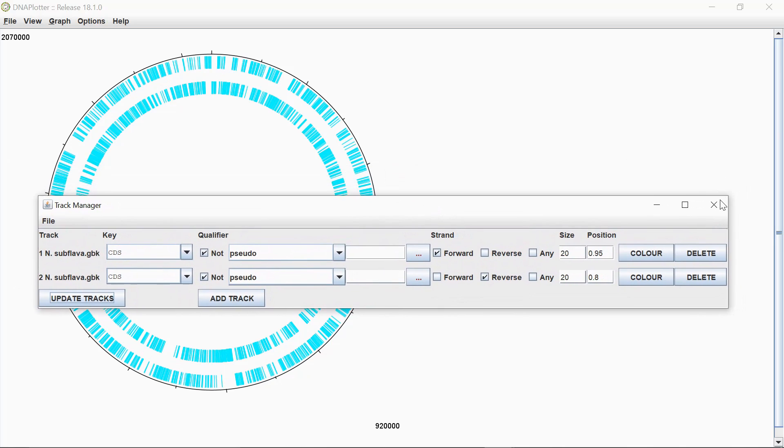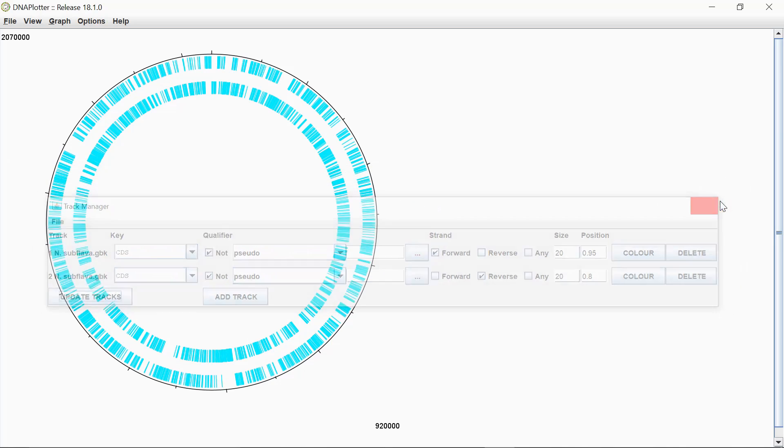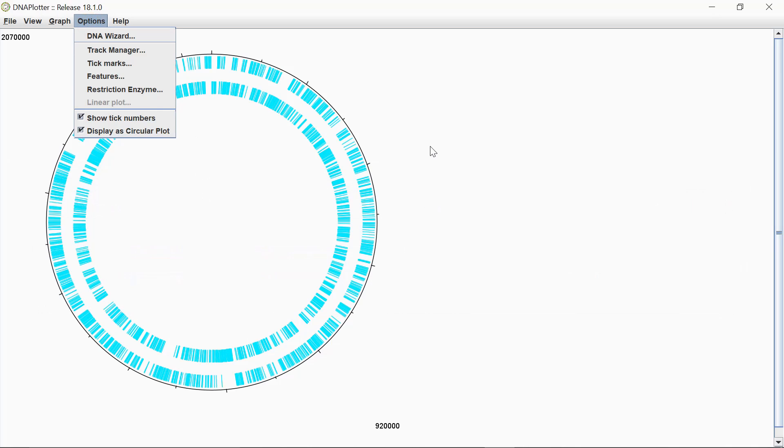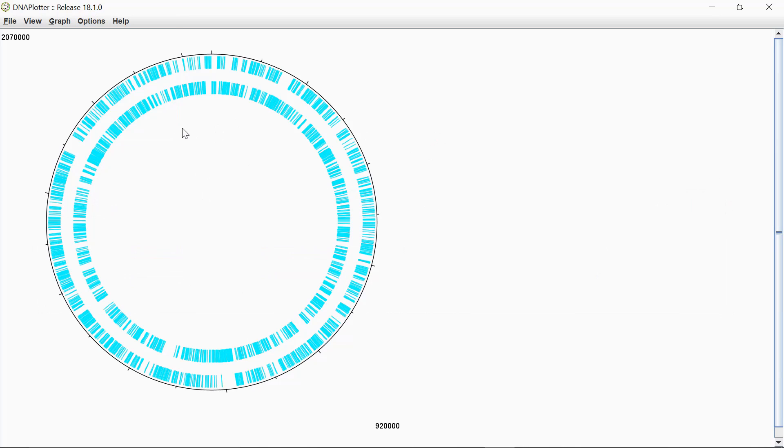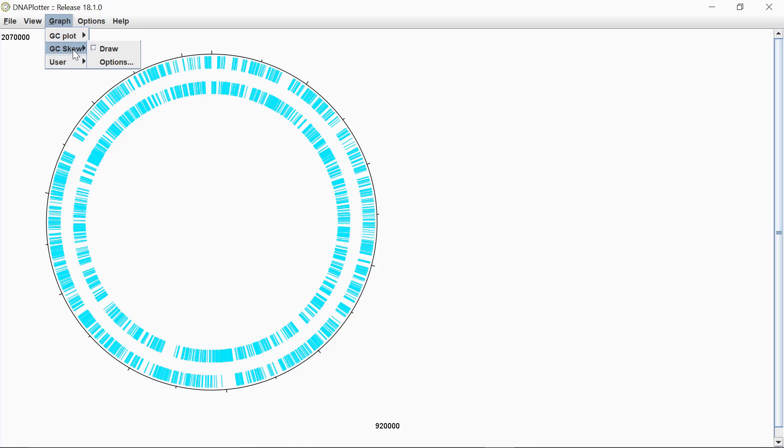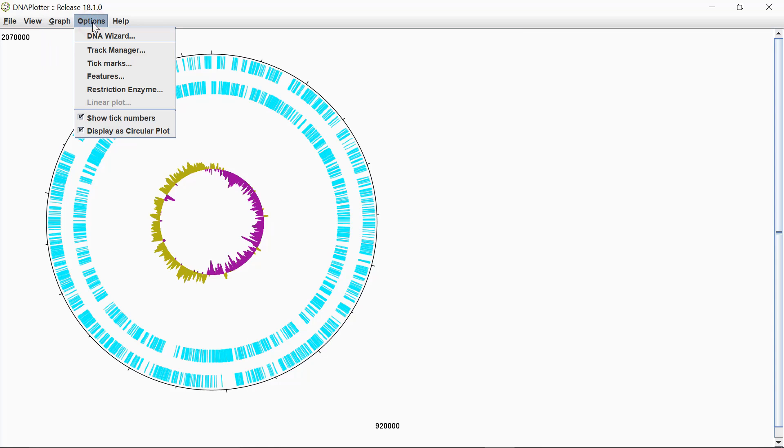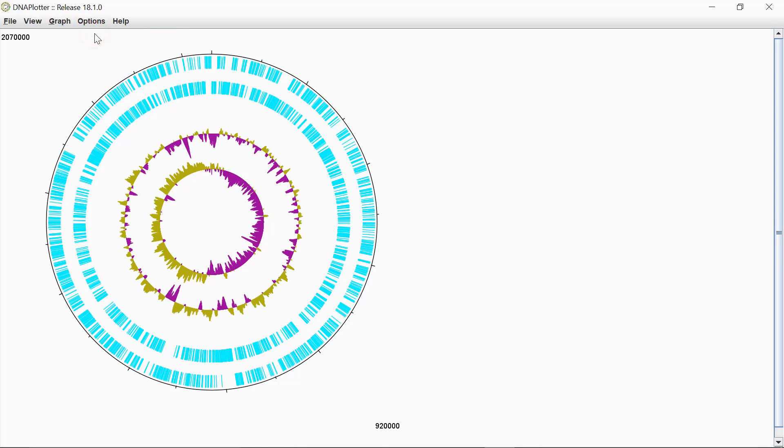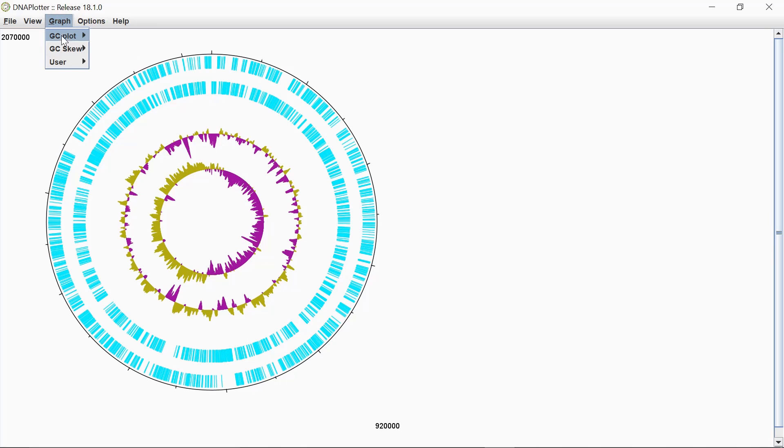There's other features in here that you can actually fill in this center bit. Say for example, if you want to look at the overall GC content of the genome. If you go in graph, you can choose GC plot or GC skew. And this is quite useful to look at regions of the genome that might have different GC content. If we just look at GC skew, for example, and press draw. Additionally, graph GC plot and draw. That's going to look a bit like that. So you might find that your cluster of genes that you're looking at might fall within a region with a different GC content. I'll just take that off for now.